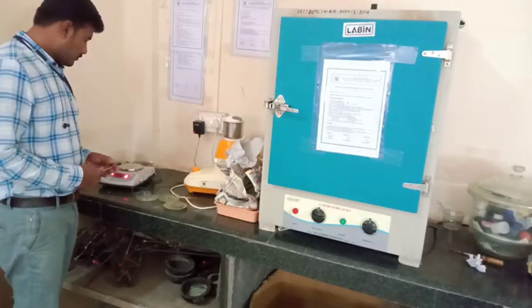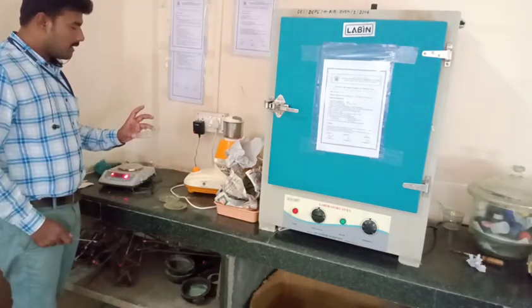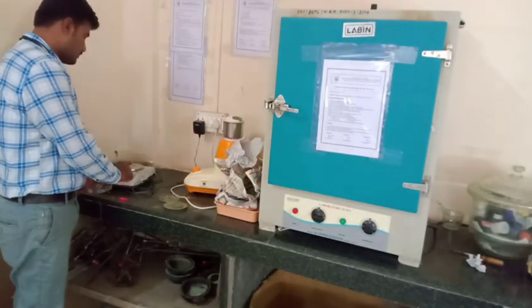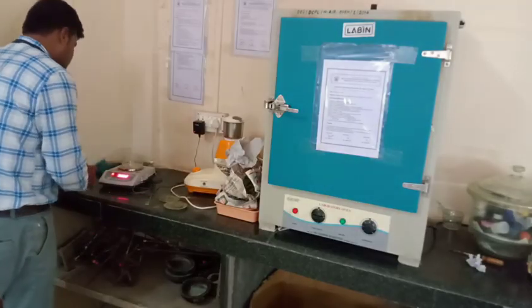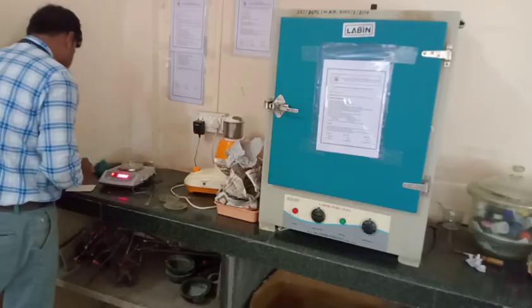Now coming to the experiment. First we will take the weight of an empty petri dish. Tare the weighing balance to 0 and take the weight of the empty petri dish. Note down the reading, that is 50.50.